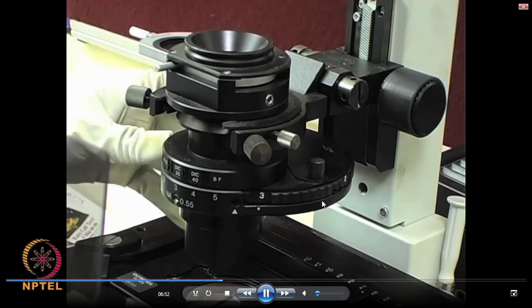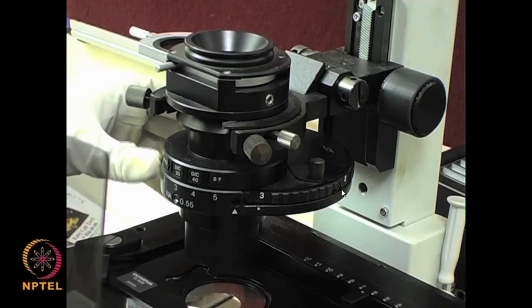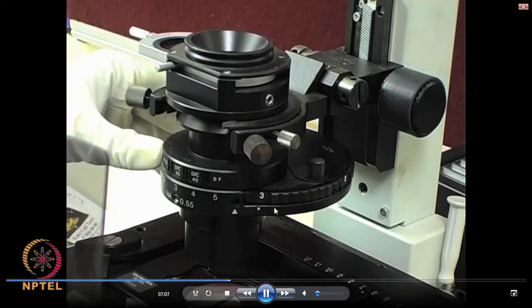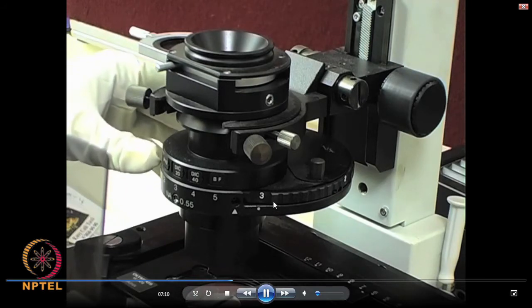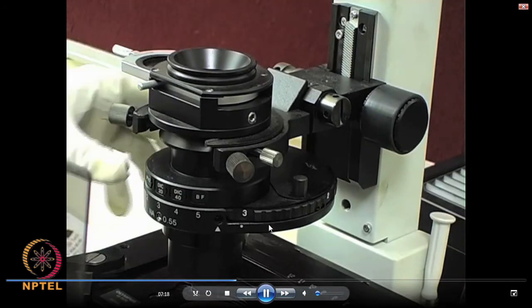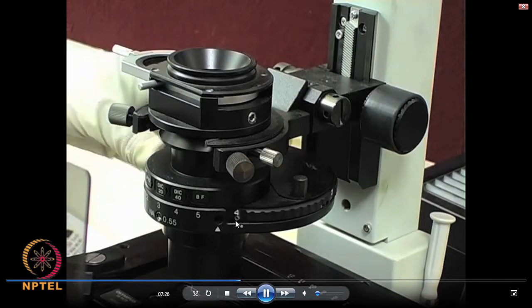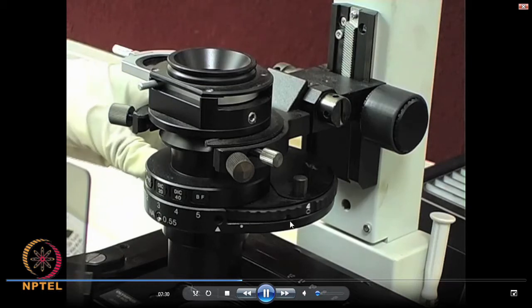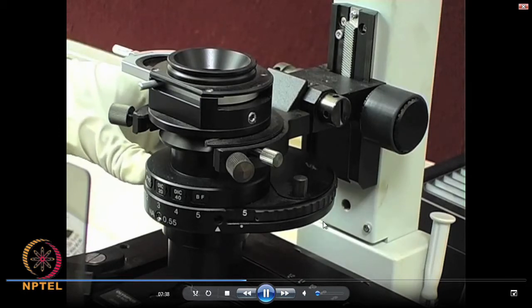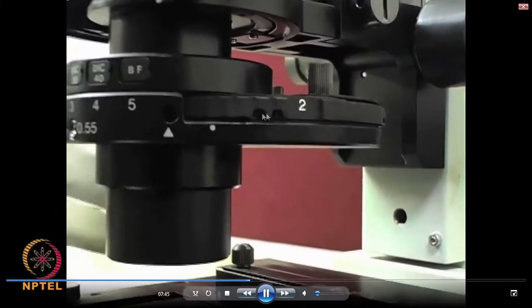In this set of condenser apertures, 1 and 2 are for phase contrast mode and 3 is for DIC mode, that is, differential interference contrast mode. We will see this in much more detail when we deal with that particular variant of the microscopic technique. And 4 and 5 apertures are meant for bright field illumination. So you have this set of condenser apertures here, and appropriate apertures are chosen depending upon the mode of operation.